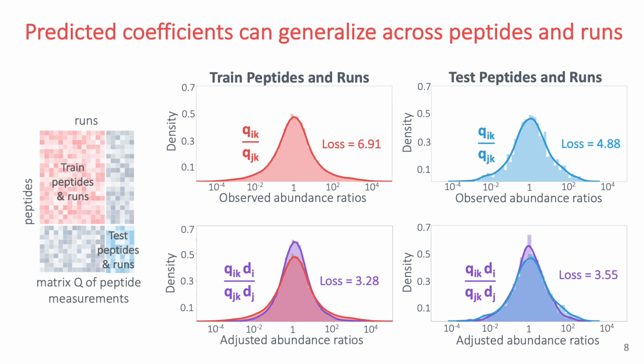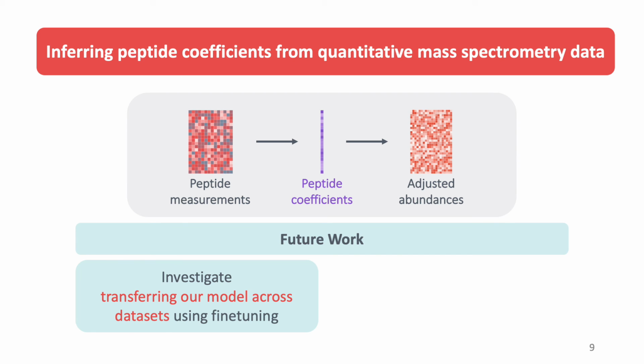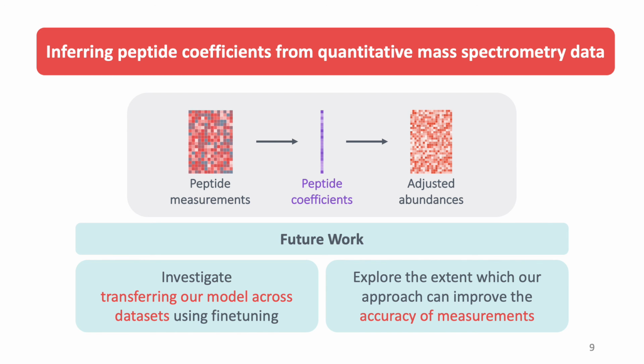Looking ahead, we want to investigate transferring our model across datasets to show that our model is generalizable across datasets as well. And we also want to explore the extent to which our approach can improve the accuracy of MSMS measurements and can help with various quantitative MSMS analysis.